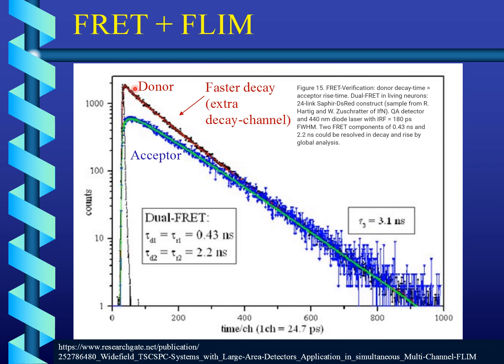So let's say without Förster transfer, it would decay like this, slower. Now we have a faster drop. And so this is the quenching effect of the donor, reduced lifetime of the donor via the extra decay channel, which is the Förster transfer that can make the donor give its energy away quicker than usually.